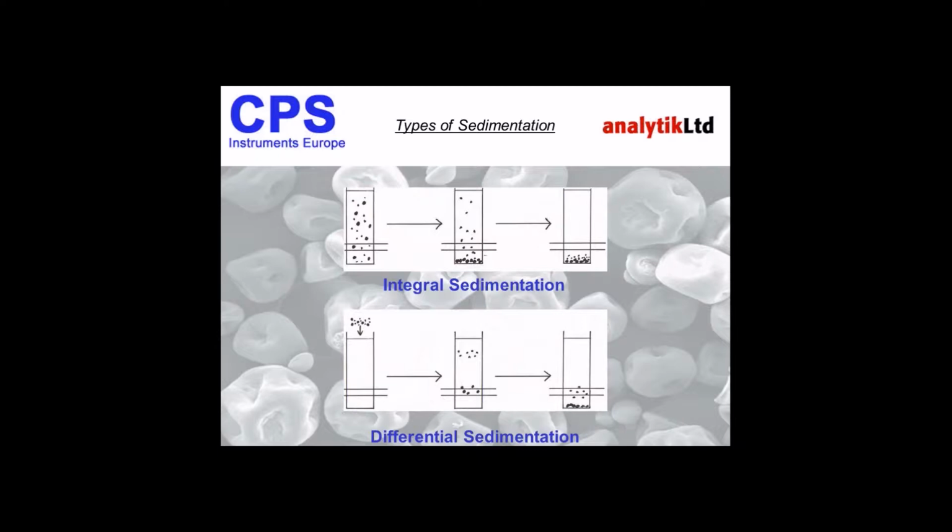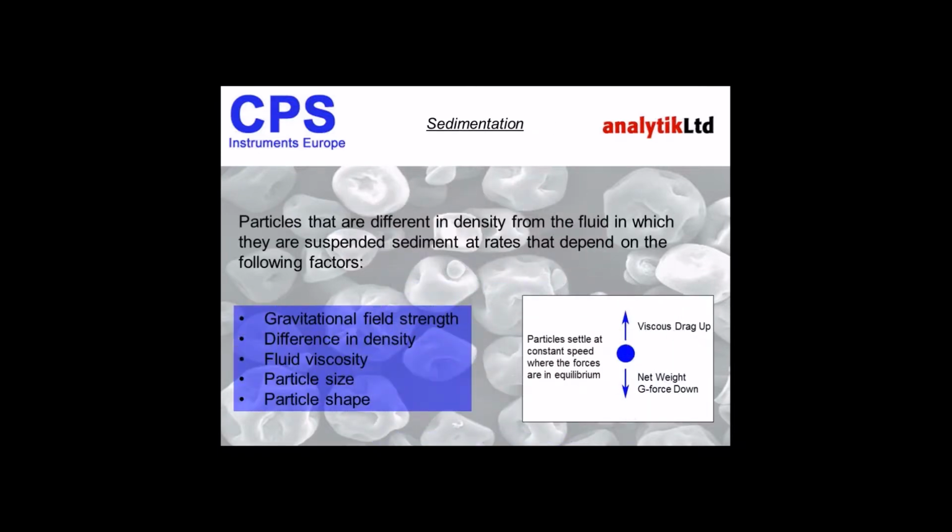When a monochromatic light source is used, we can use Mie light scatter theory, and we can apply this to the intensity data to calculate particle concentration. A plot of the concentration against the calculated particle size diameter produces a differential plot, where only a tiny part of the distribution is being measured by the detector beam at any time, hence a differential sedimentation plot. Okay, so let's talk about sedimentation.